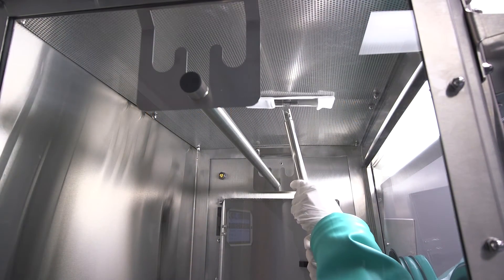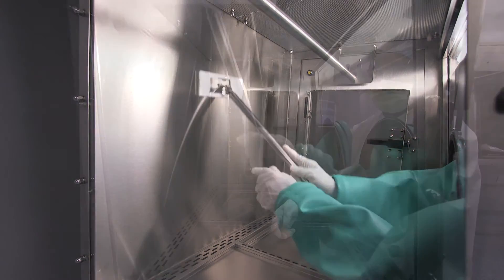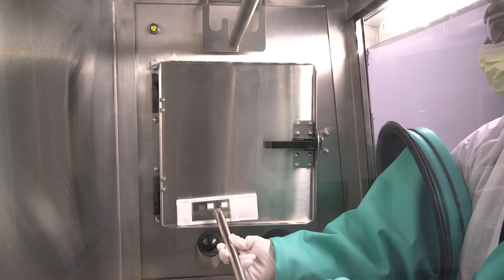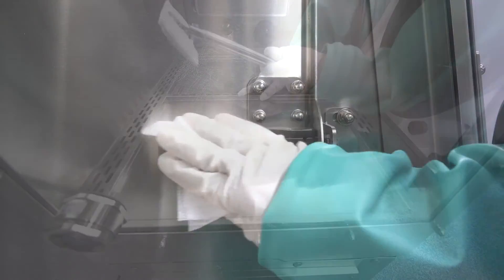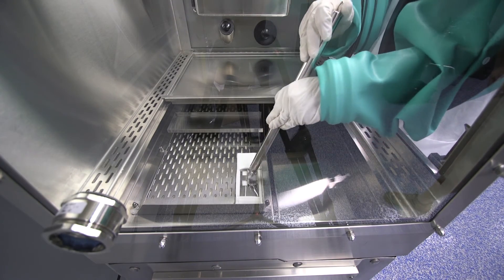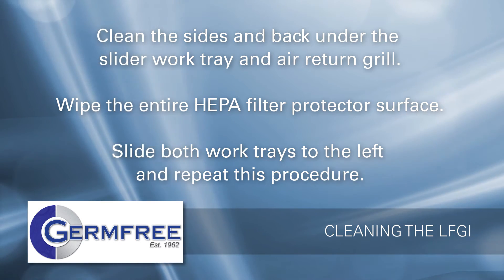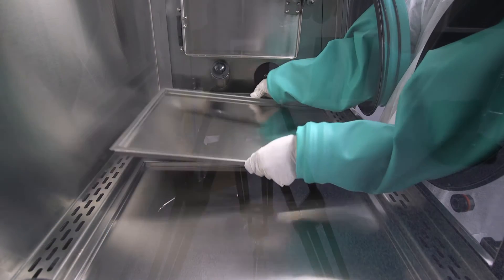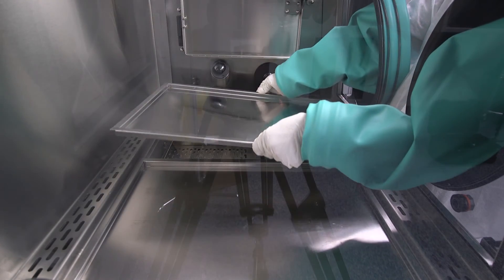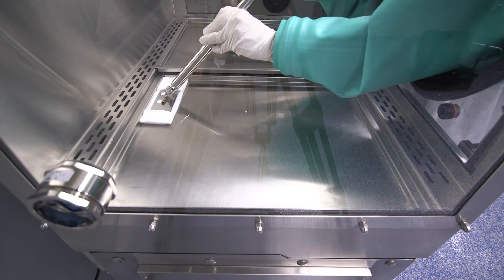Complete the following steps to ensure the work area is thoroughly cleaned. Wipe all surfaces of the filter diffuser at the top of the work area. Clean the back wall and both sides of the work area. Clean the airlock door, ensuring all surfaces including the handle are wiped thoroughly. Clean all bottom work surfaces. Slide the left tray over the right tray to get below the work trays, cleaning the sides, back, and air return grill underneath. Wipe the entire HEPA filter protector surface. Slide both work trays to the left and repeat. Sliding work trays are removable for cleaning if preferred — simply lift them out. Clean the sliding work tray including all inside and outside edges, then repeat the procedure on the other tray.